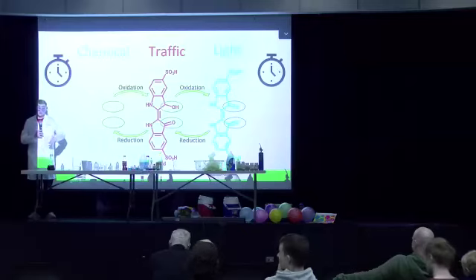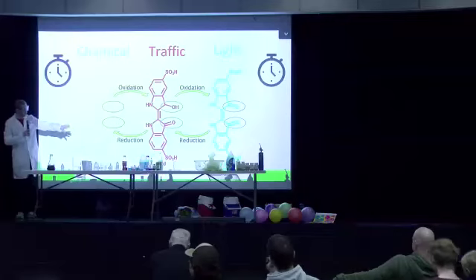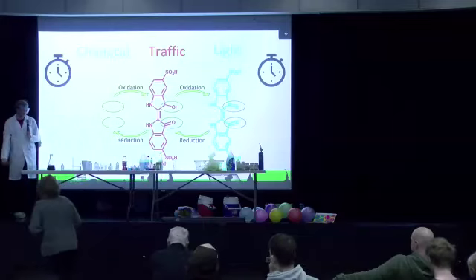So if we had less of the indigo carmine, it would be a nice green, and then it just switches over to the red, yellow, and then we shake it again, and it will go back to the green.